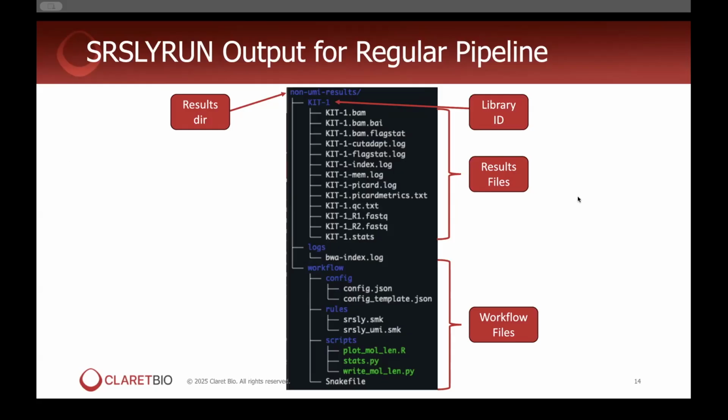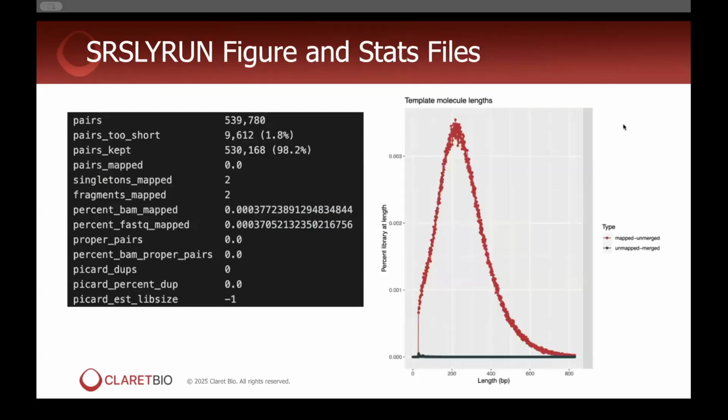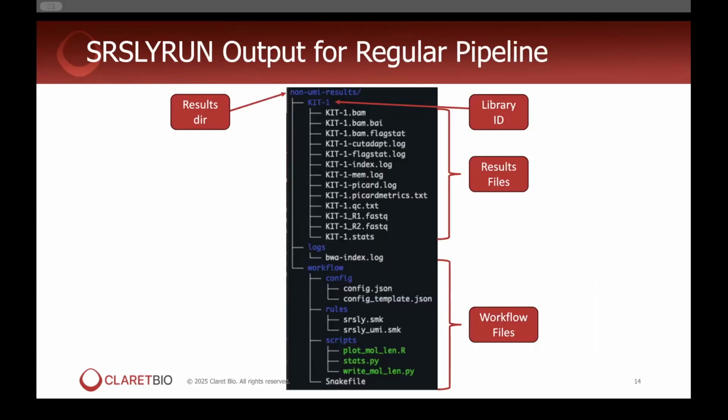And so next we'll be talking about some of the different stats files. I'll just go back here very briefly. We have the kit1.stats file.